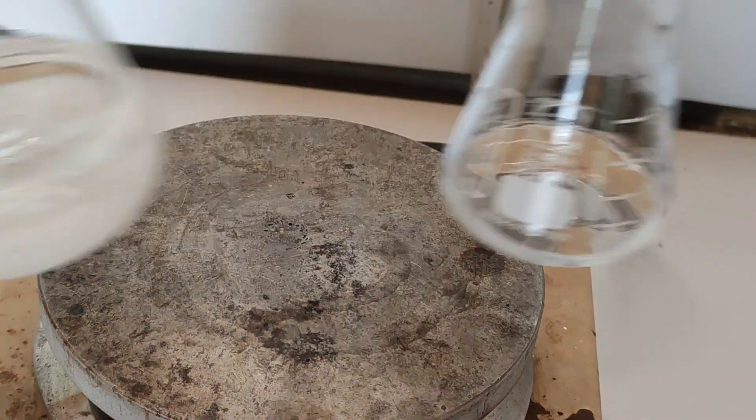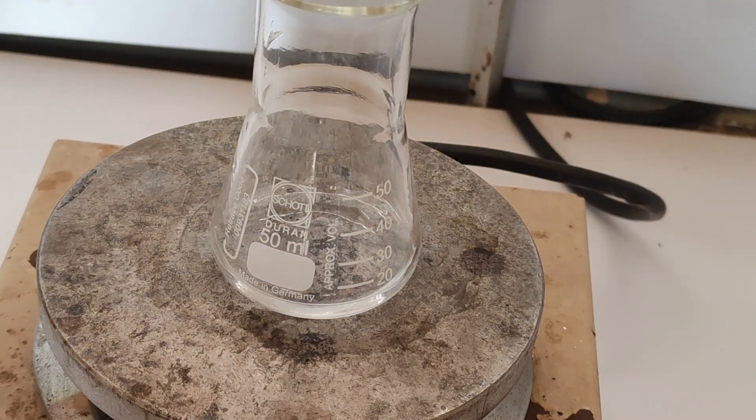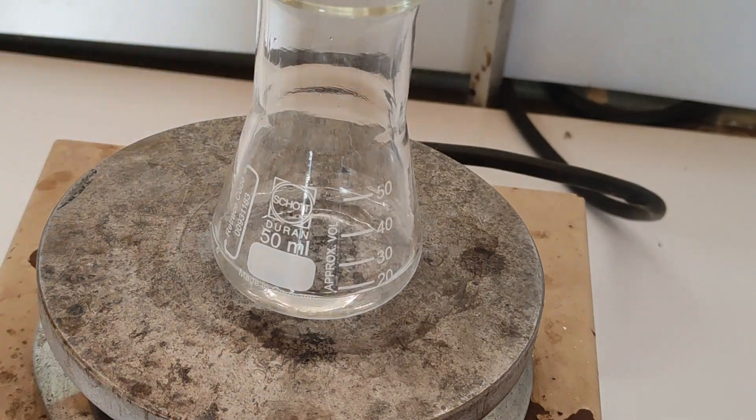To a conical beaker is added about 10 milliliters of water and the rest of the sodium hydroxide solution. The sodium borohydride is then added and stirred until completely dissolved.